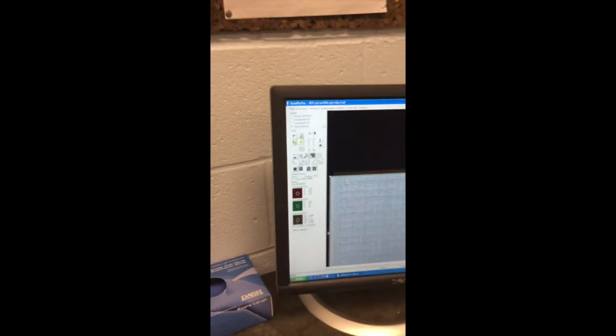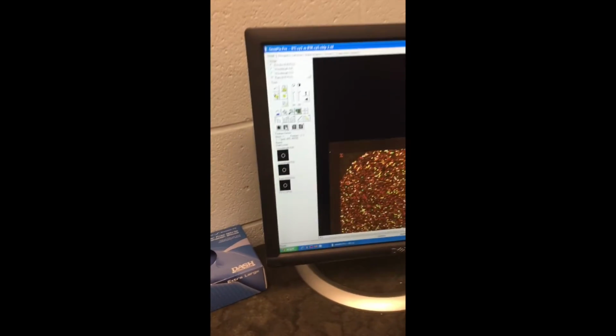Now I'm going to zoom in, and I'm going to make sure, now obviously there's a lot of circles there, and, whoops, I'm moving the map around. There's a lot of circles there, and if you moved them even slightly off, with these 44,000 spots, you could end up having kind of like a frame shift error. So you want to make sure that this map is on the right spot. Let's just show you, see there's the array, there's the map. I'm going to move those circles right over the top.